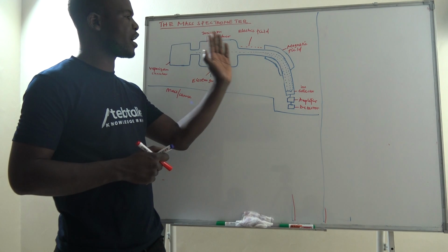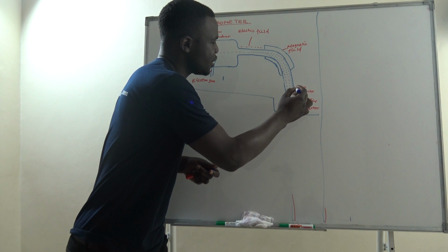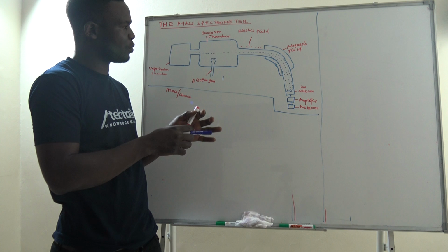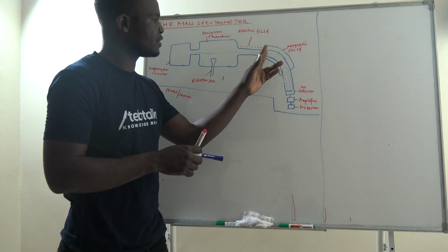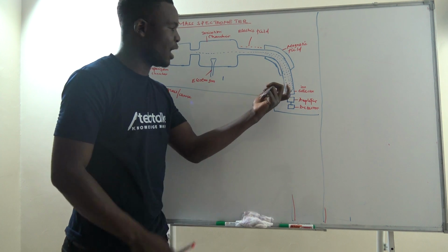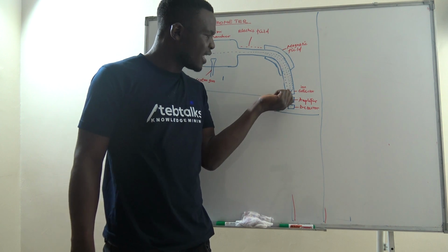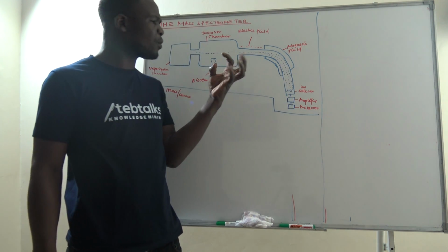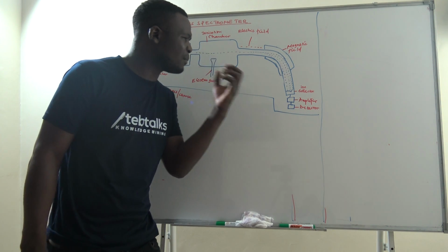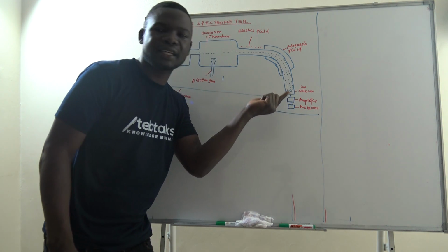An ion that is heavier is deflected least, and is this one that we are seeing here along this line. Then the lightest ion, of course, when it is light, is deflected most, and is the ion we see here. And now these ions fall on the ion collector. When they reach the ion collector, they produce pulses of current. When I say pulses of current, they produce some small electric current at the ion collector here.